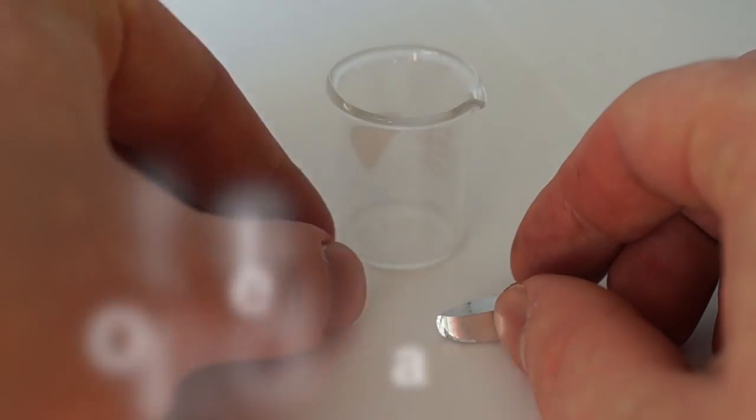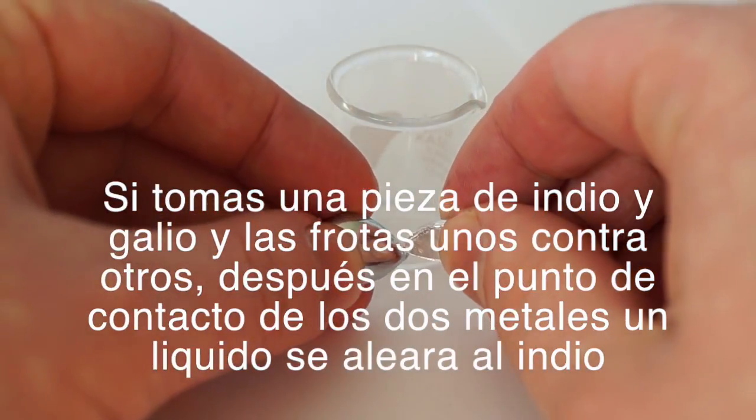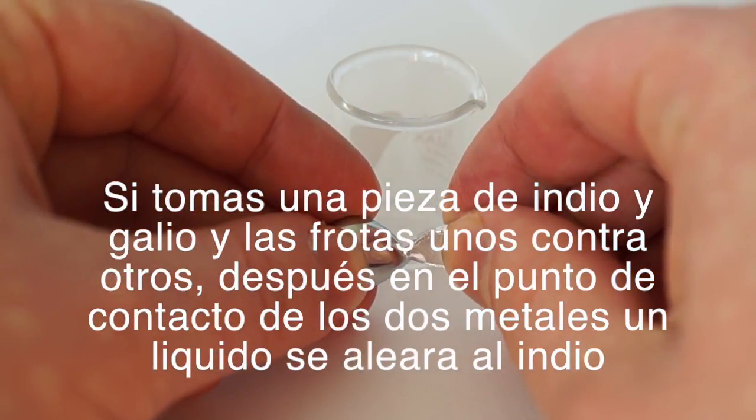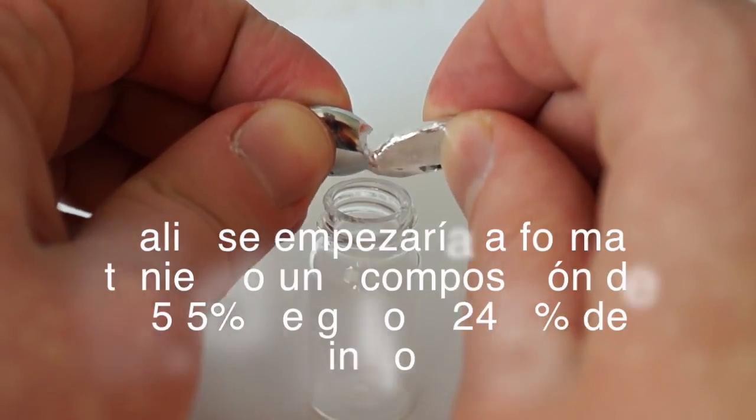If you take a piece of indium and a piece of gallium and rub them against each other, then at the point of contact of the two metals, a liquid alloy of indium-gallium will start to form.